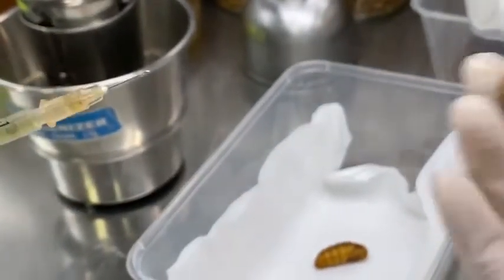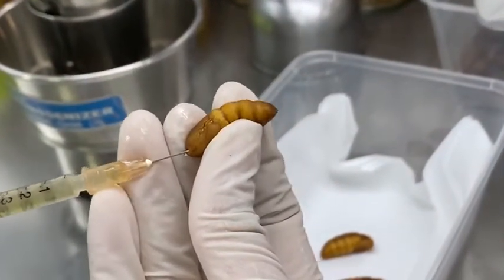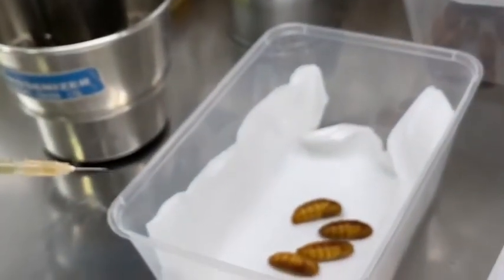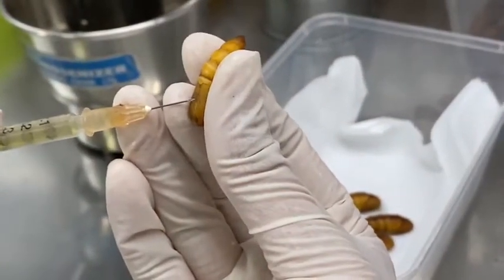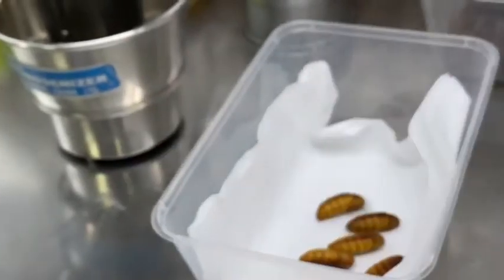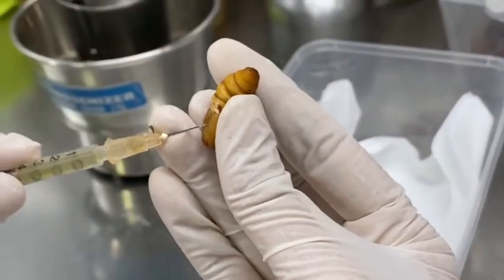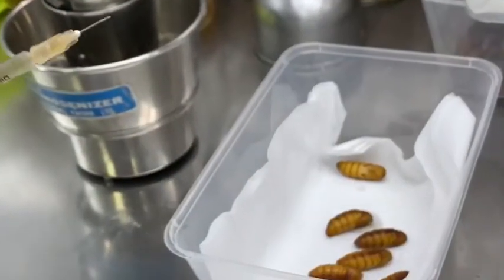Thorax. Head. These are very important points in the process. We want to keep our pupil alive to make the culture more strong.